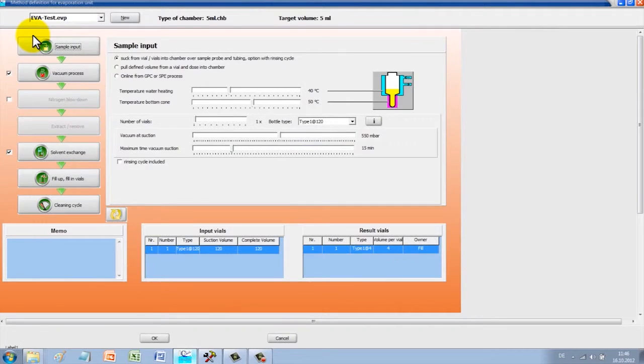Part two is for the area of method setup and mimics the manual process. This is detailed in such a way that even complex procedures are displayed in a simple manner.